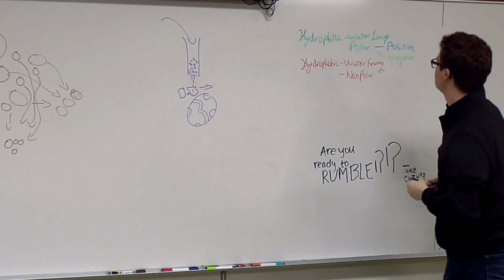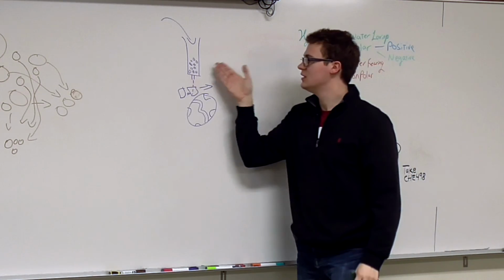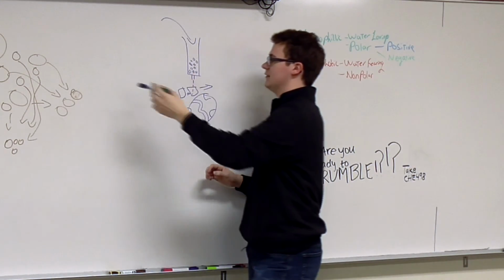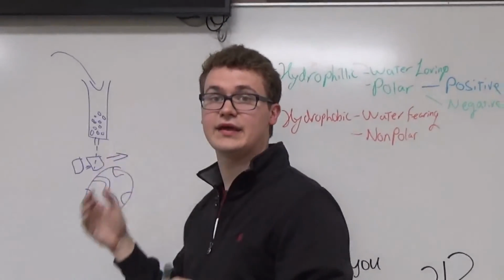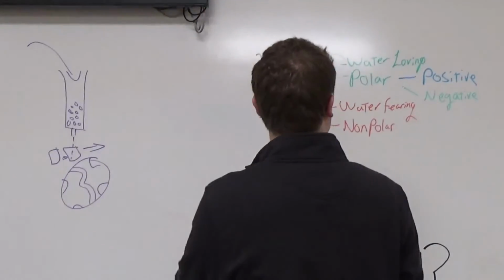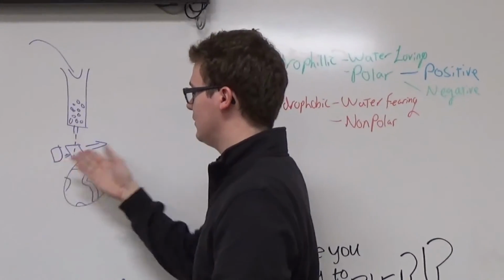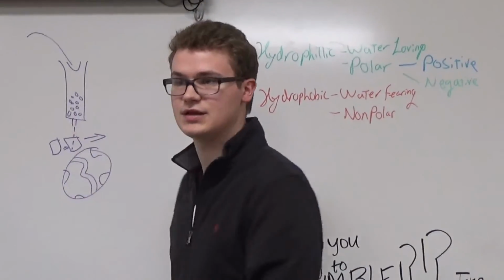And so you could use beads that are, say for example, positive, put through something that has positive and negative molecules or atoms, and you would expect the positive ones, which hate being around their own kind, they repel, opposites attract, you would expect the positive to make it through very quickly if these beads are positive, while the negative get caught up with all the attractions, right? Using the same little vials to catch different drops, you would start seeing different tendencies from those.